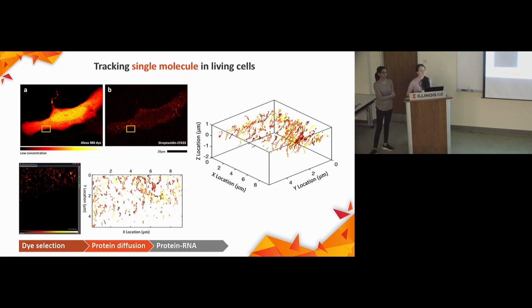In order to track these molecules, the fluorophores need to be sparsely distributed, right? So that you can localize a single fluorophore at a time. The labeling is very important. How do you make sure in these experiments that the fluorophores are distributed sparsely? In our experiment, we micro-injected the streptavidin that is labeled by the fluorophore.